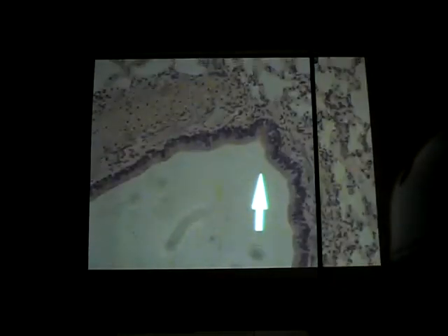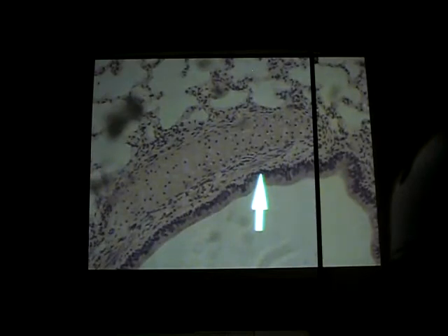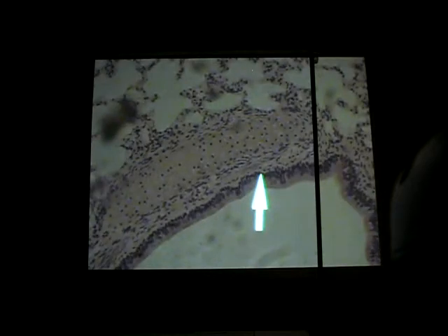I could show you the bronchiole on a slide by itself, but if you're seeing it inside the lungs, well, we know that's not the trachea. Another thing you're looking for is that it doesn't have C-shaped rings of cartilage. It has just small pieces of cartilage going around in the submucosa. Is that a bronchiole or a bronchus? The bronchus. So if you're seeing cartilage, it's still your bronchus. If there's no cartilage, then we know that we've gone down into the bronchiole.